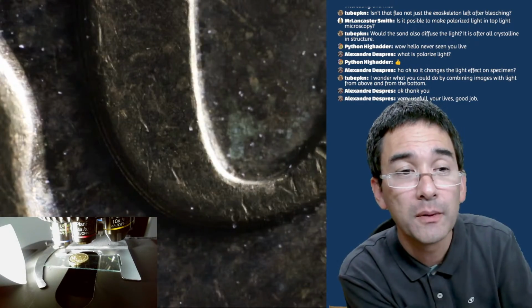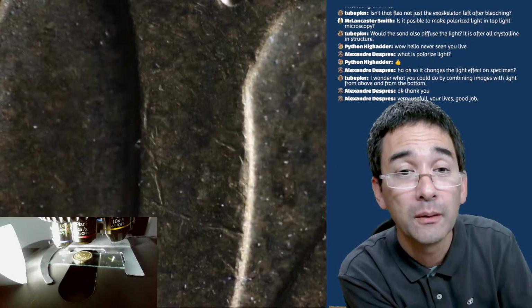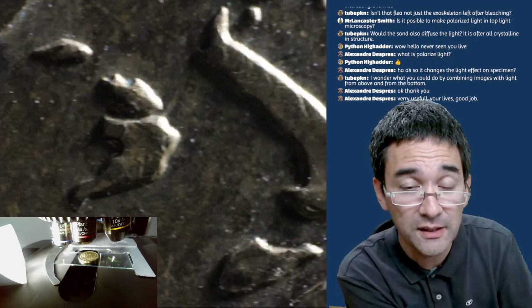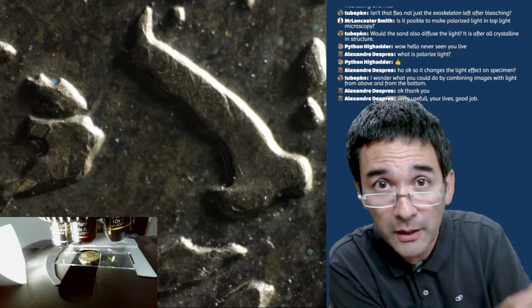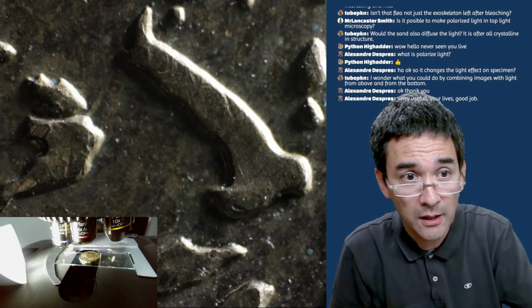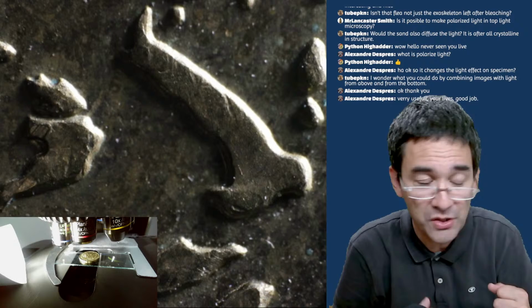So why am I doing this type of video on this topic? Well, because in the microscopy community, many people want to observe these things, and they say, okay, I need to get a stereo microscope, obviously. And under a stereo microscope, make no mistake, it looks even better because you see it three-dimensionally. You're going to see the different textures actually go up, like you can almost touch it, so it's much more immersive.